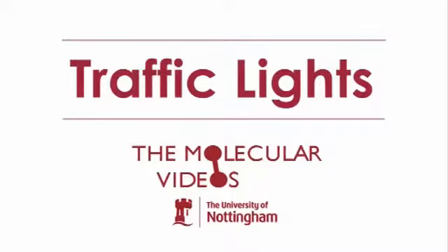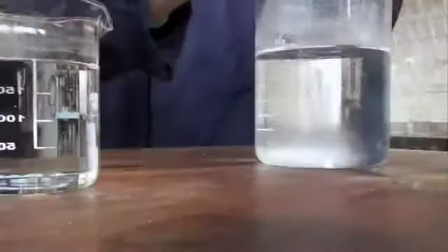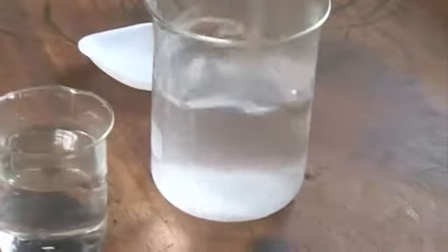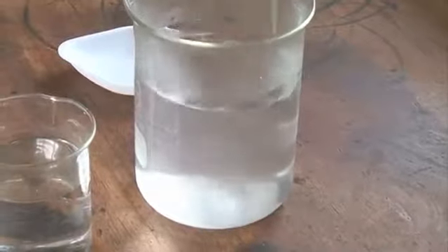So what we've got here is some hot water and cold water. That's it. That's all we've got in there at the moment, and we're going to add glucose, a type of sugar, into this one, and sodium hydroxide's going into this. So we give that a stir. You can see there it clouds up, and you've got all the sugar dissolving in the water.